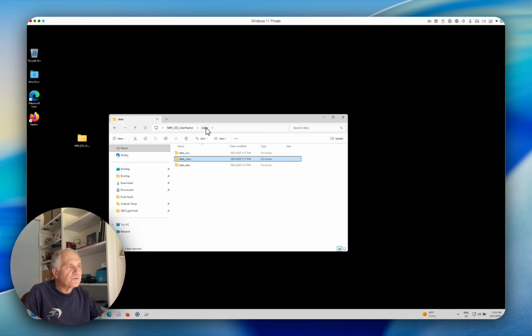What we need to now do is reduce these data and put them on absolute scale and everything else. And we do it in Igor using a procedure, which I'm going to demonstrate now. This is an older procedure, which will work for data going back at least 10-15 years and will be kept alive or available into the future. I'm currently working on a much faster procedure, which skips many of the steps I'll be showing now. That one will be available probably in January, February as a beta version, and will be much easier.